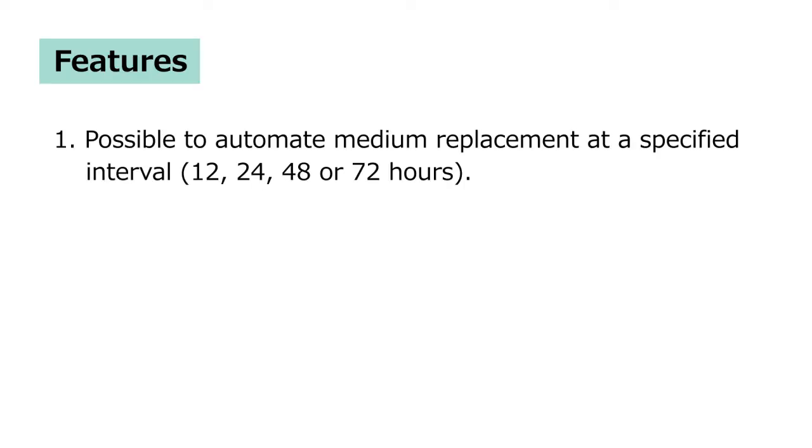This system has four features. First, it is possible to automate median replacement at a specified interval such as 12, 24, 48 and 72 hours.